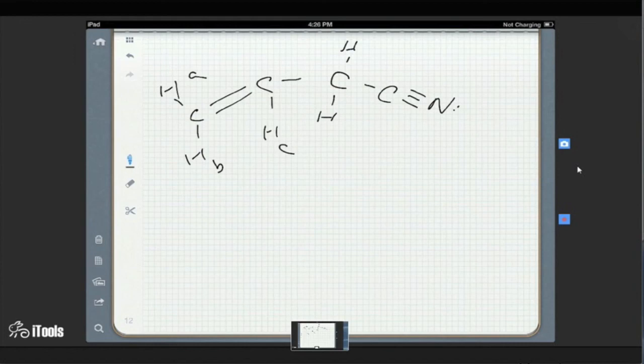And he said that those numbers aren't definite. So they kind of just fall there. Well, if this H is a 2.5, the H that's only seen next to this could be closest to 3, maybe. All right, that's our final answer for now. Yeah.